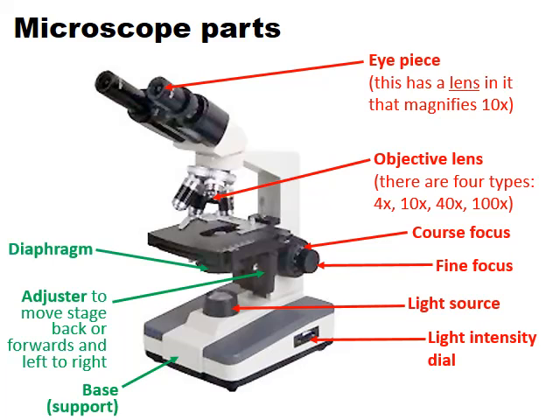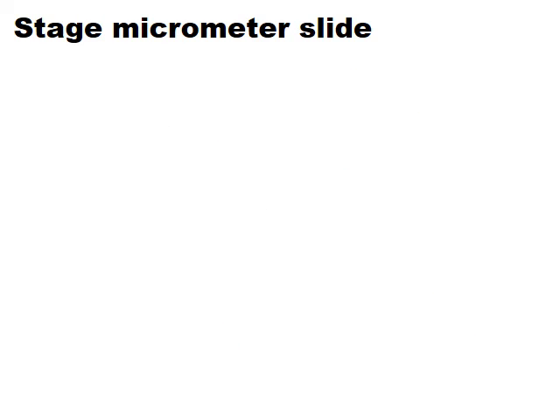The diaphragm beneath the stage allows us to modify the amount of light going through our sample — we can open or close it depending on how much light we want. The stage has a little clip on the side so that once we've placed our microscope slide onto the stage in the metal frame, we can clip it down to keep it firmly in position.